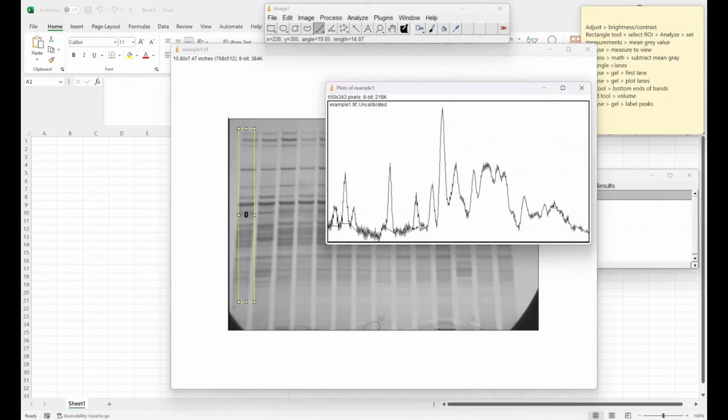So you can see here I'm drawing lines underneath to define where my bands are. This is very much a manual process and it's very subjective. Would I draw them diagonally like this, or would I draw them straight across like that? I may do it one way and someone else may do it another way, so it's quite hard to replicate this between different users and get similar reliable results, because it's not exactly standardized.